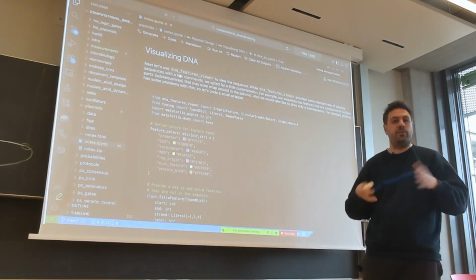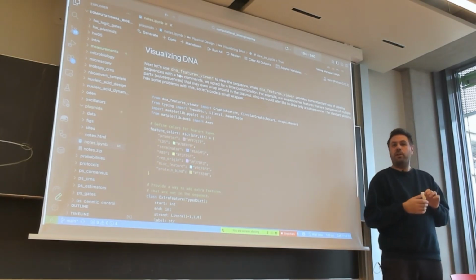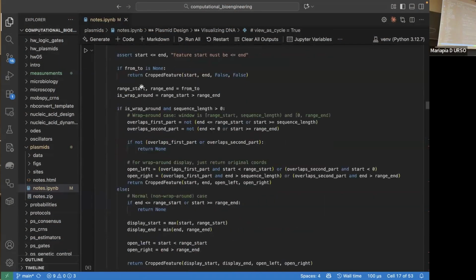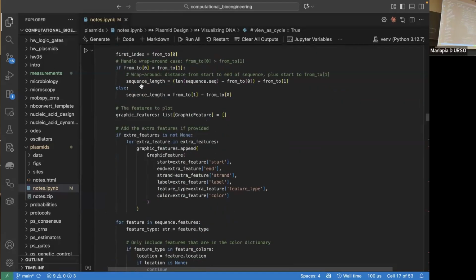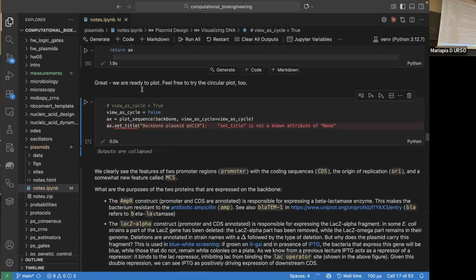And we had to do some fixes, and this is all here on the website. We will perhaps also at some point write a library with such simple functions that you can use, but otherwise at the moment you find it here in the cell. So I did the coding for you here. It's a bit lengthy. And here we can use it.